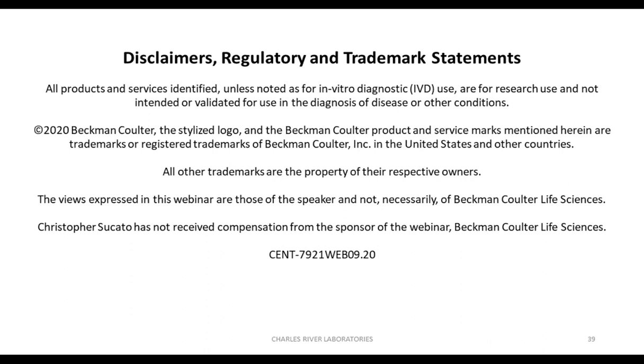Yeah, we do. At Charles River, we have a few complementary methods that are available and are known to the field in general. Some of these are older techniques that still have some utility. Transmission electron microscopy, or TEM, has been traditionally used to characterize AAV products and produces some nice image-based results. That's still done to some extent, but as the field advances, AUC is quickly becoming the method of choice, as I say. It is really becoming the front runner or the gold standard for empty full characterization.